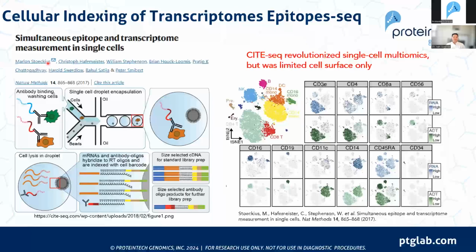And essentially what they did for CITE-seq is they used these oligo-conjugated antibodies. In this case, the capture sequence for their oligos was a poly A tail. Now, that was done to ensure that the oligo from the antibody, or the oligo-derived tag, is captured through the 10x Genomics kit, which, based on this chemistry, which is the v3, recognizes the poly A tail capture.